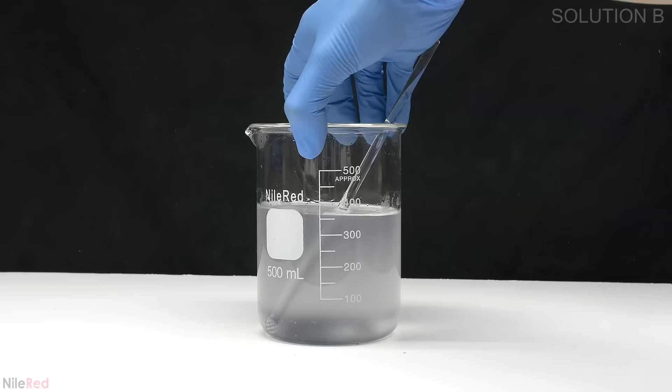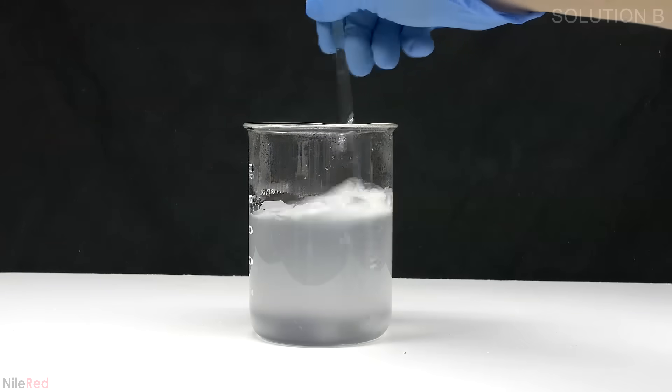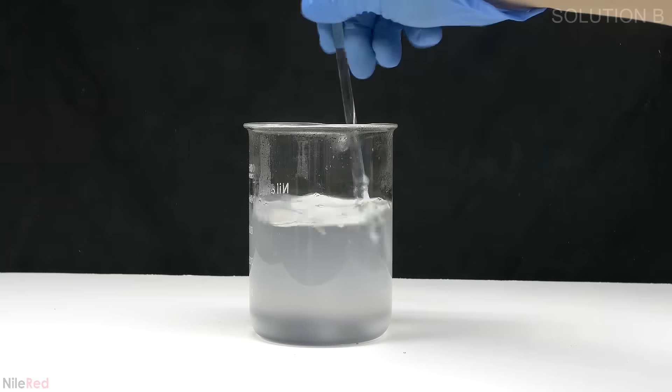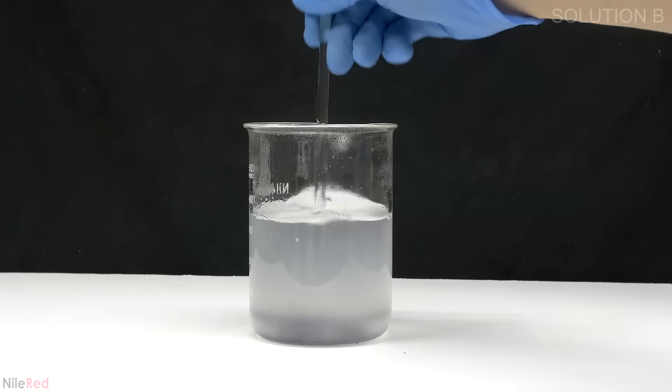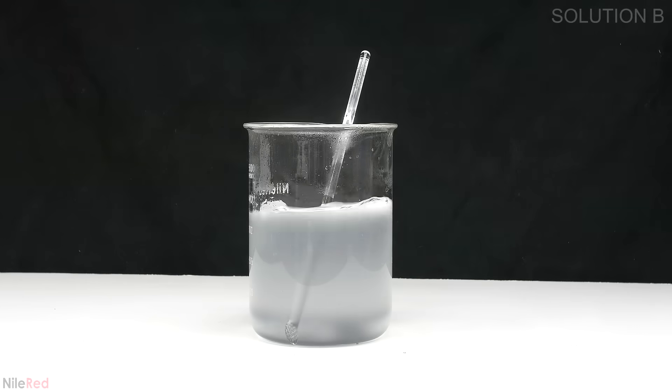In the microwave it's brought to a boil and I continue to boil it for something like 5 or 10 seconds. Although this clears up the solution quite a bit it's probably still going to be cloudy. Anyway this starch solution is placed on the side and I continue making the other part of solution B.